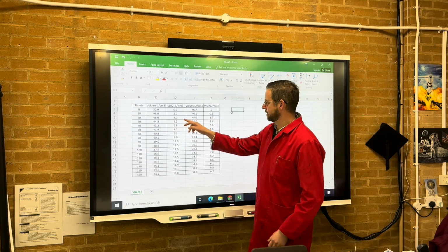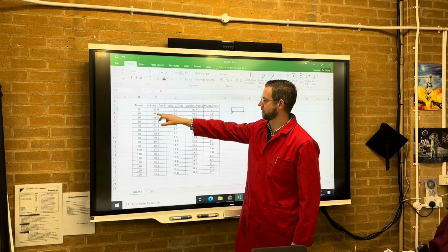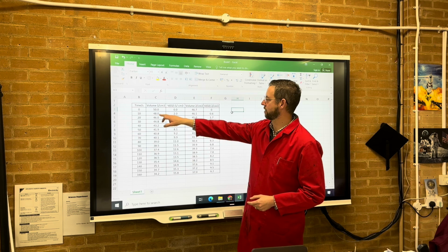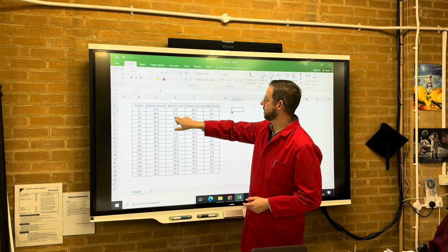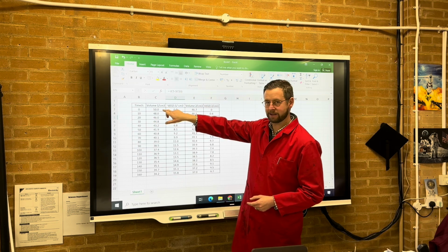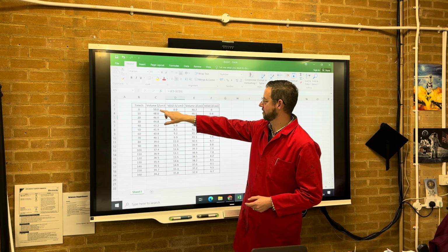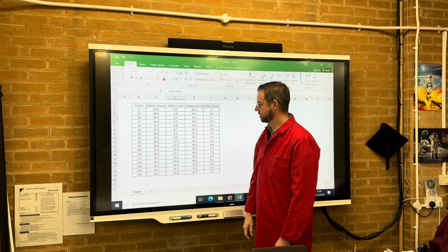So there we have it. This is the amount of oxygen that has been produced each time. You see the difference between 50 and 48 is 2, so therefore it must have been 2. On something like this, which is Excel, I can always subtract from a particular stationary number by putting $ in front of the row and the column. So in this case it would be C5, this number, minus $C$3. And I've put a negative in front of that so that all of these are positive numbers.